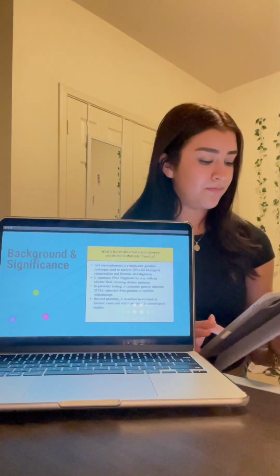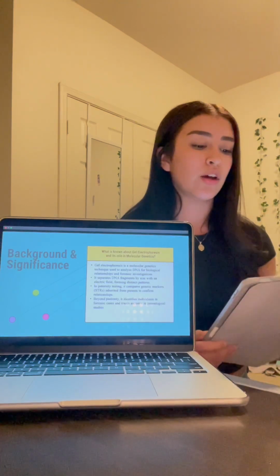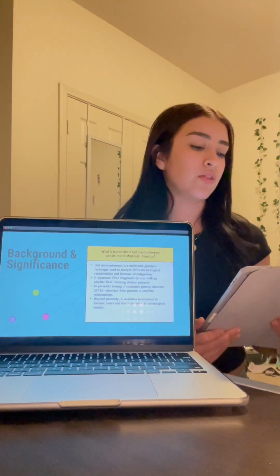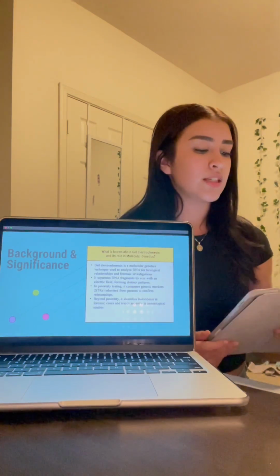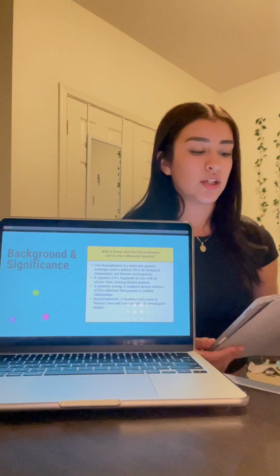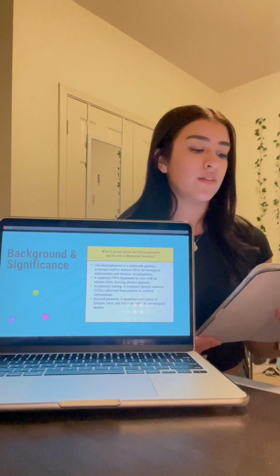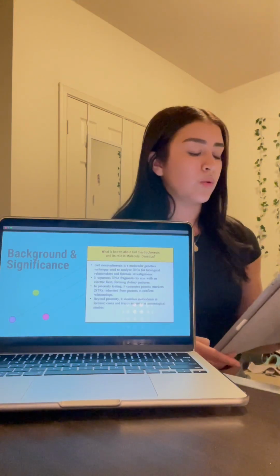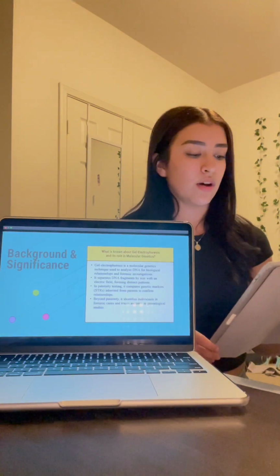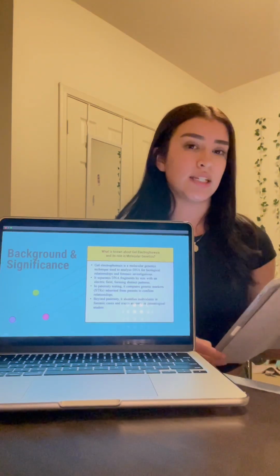Background and significance. Gel electrophoresis is a well-established and widely utilized technique in molecular genetics with significant applications in various fields, including biological relationship analysis and forensic investigations. This technique involves the separation of DNA fragments based on their size by applying an electric field to a gel matrix. DNA molecules, which are negatively charged, migrate towards the positive electrode, with smaller fragments moving more quickly through the gel than the large ones. This differential movement results in the formation of distinct patterns or bands, allowing scientists to visualize and compare DNA samples.